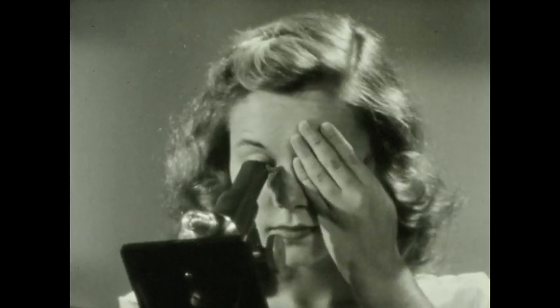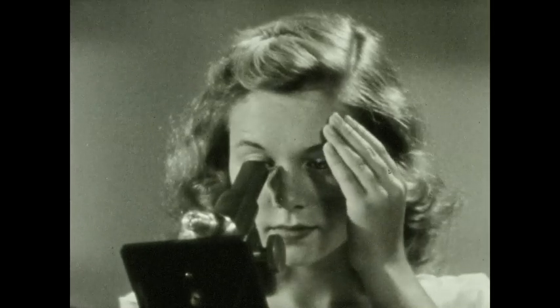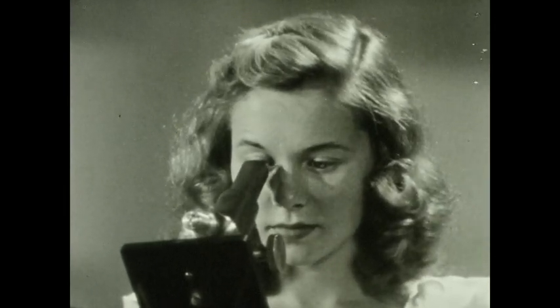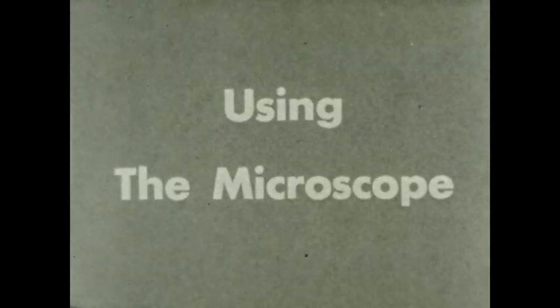Doesn't work? We'll try it again. Don't worry, it'll come to you, and it'll help to make your work much easier. And now let's review the most important rules for using the microscope.